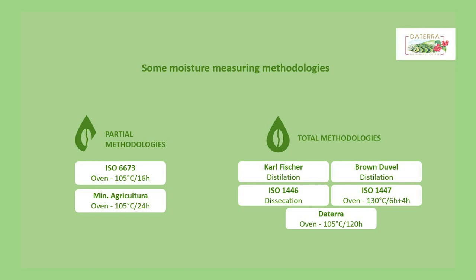So when we say that coffee moisture levels should be around 11% moisture, what we're talking about is, if you get a coffee sample that is dried well and weigh it, say 10 grams, you put it in the oven for a specific amount of hours, and then you can remove all the moisture from it. And it takes days and days until it happens, okay?